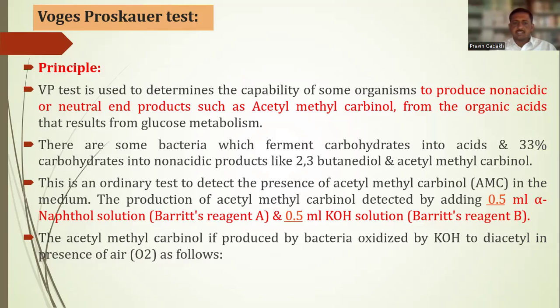This is an ordinary test to detect the presence of acetyl methyl carbinol, in short AMC, in the medium.